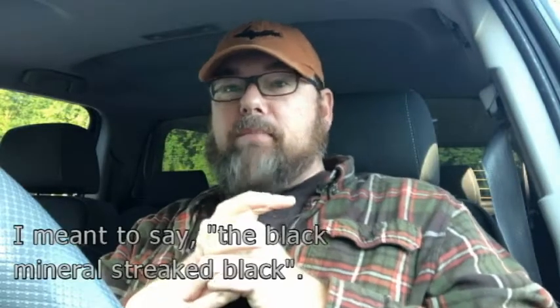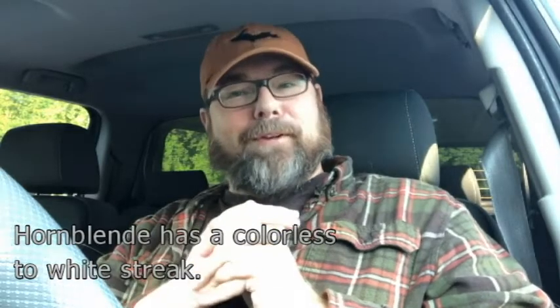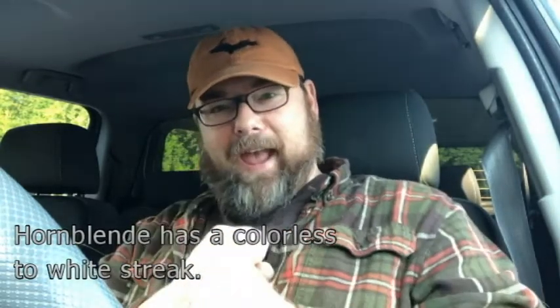But I came to a couple of revelations with this. When I was running the tests early this morning, I streaked the minerals. The white ones, there are actually 3 white ones, not 2. There are 3 white ones, and the red one all streaked white, which is typical of plagioclase and K-spars, nothing out of the ordinary. But that black one streaked. Well, I called it hornblende. I still think there's augite in there. The greenish black is still augite. But hornblende doesn't streak black. I was like, okay, that's odd.